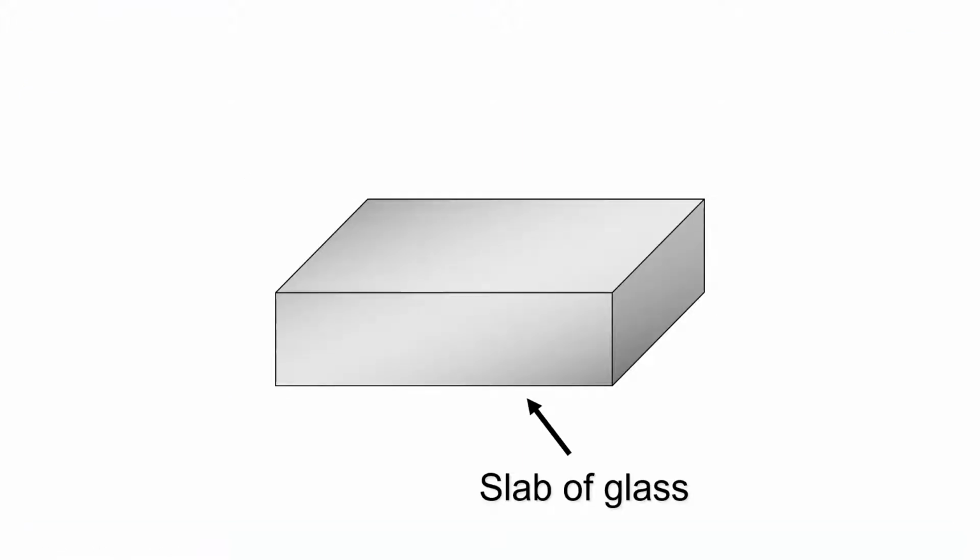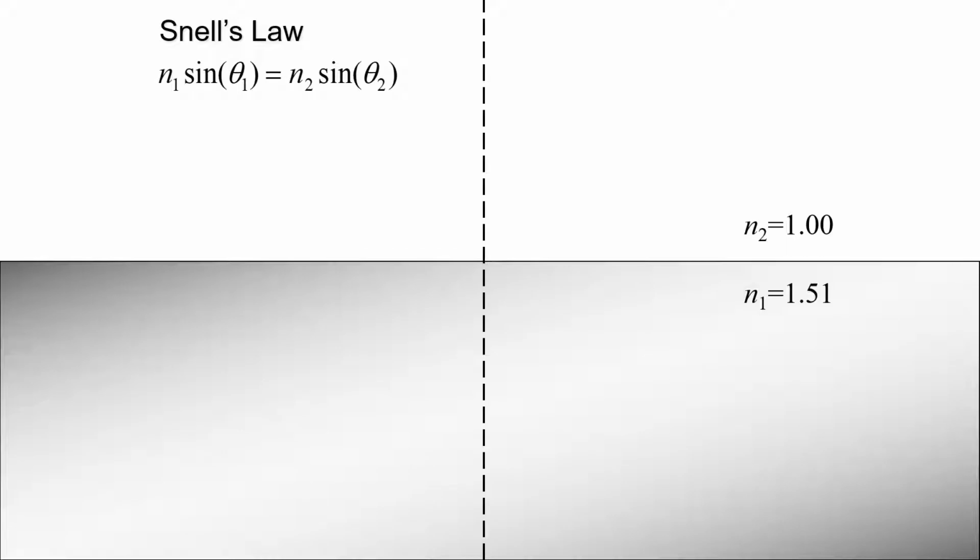So how does it work? Let's start with a slab of glass, and then look at it from its side. Most of us at some point were enrolled in an introductory physics course at school or university. And from there you might recall a law of optics called Snell's law.